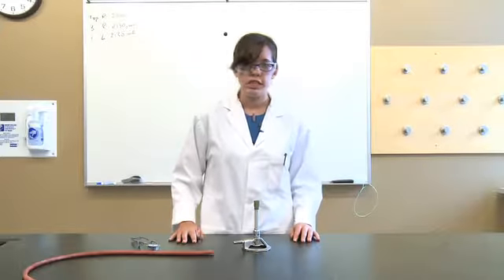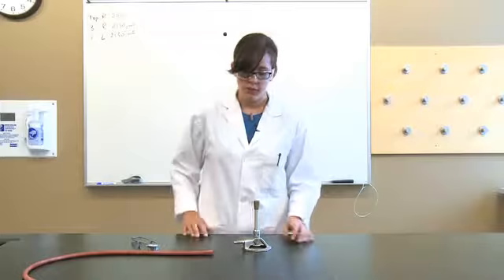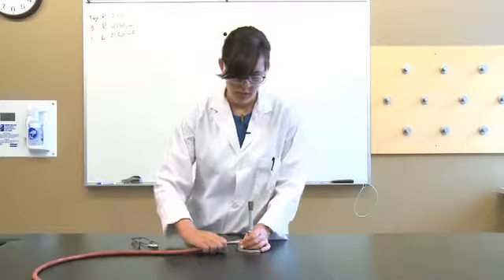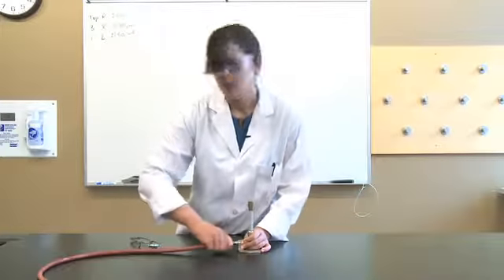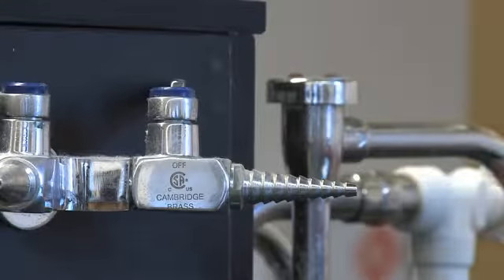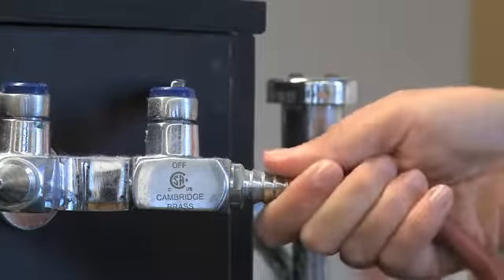Now that you know all the safety precautions, you can begin to light your Bunsen burner. The first step is to attach the hose to both the Bunsen burner and to the gas line. Make sure that you attach it to the gas line and not an air or a water line.